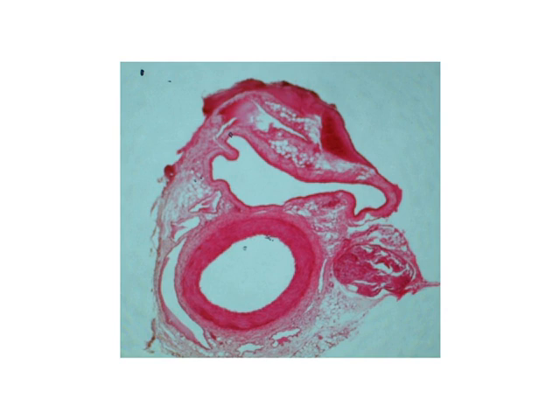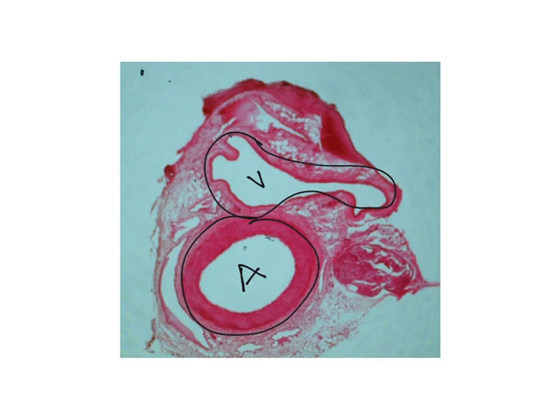Then we have a slide that depicts an artery and a vein together. Arteries pretty much run along with veins. Here's the artery right here. This is the vein right there. One thing you'll notice, veins do not maintain their shape without the blood in there. So you see it kind of collapses a little bit. If I opened that up, the actual size of the lumen would be bigger in the veins than the artery. If you look at the thickness of the wall, the artery is much thicker.